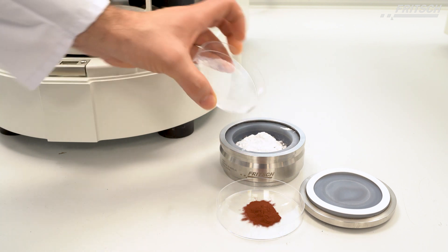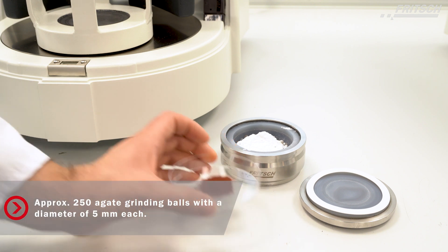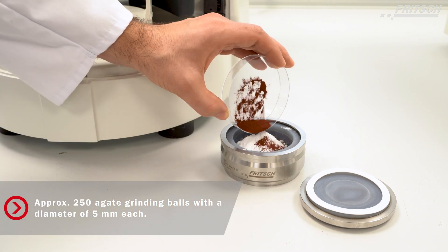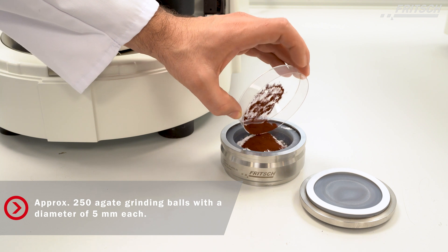This 80 ml volume agate grinding bowl is filled with about 250 agate grinding balls with a diameter of 5 mm each.